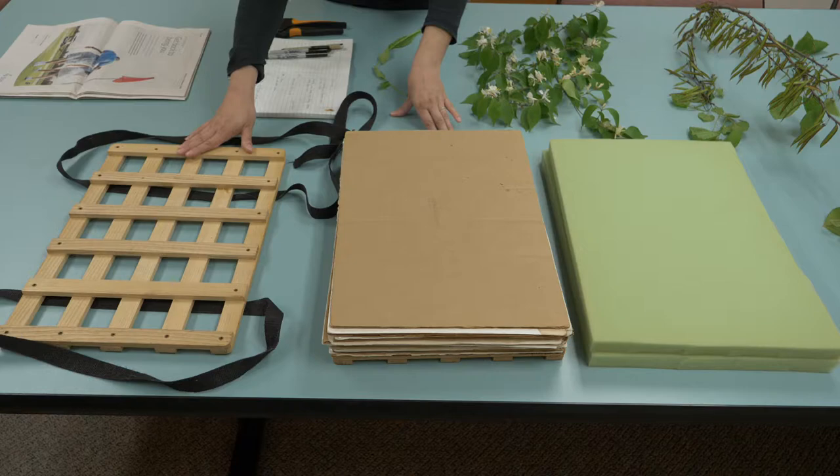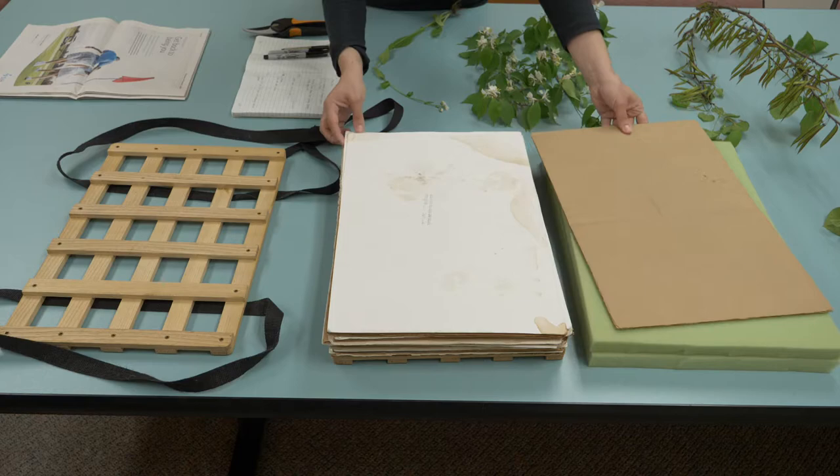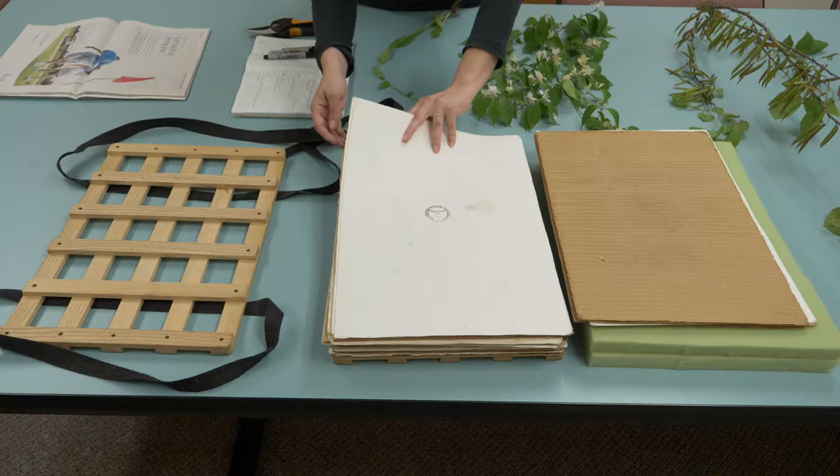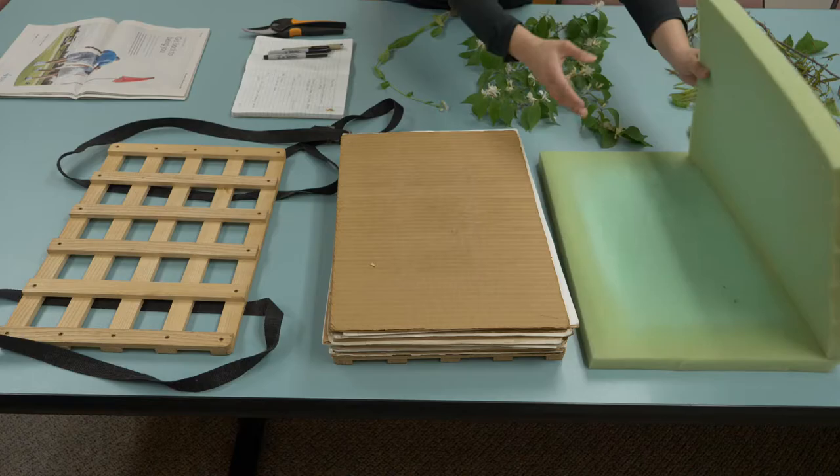A press is composed of two woody frames with straps, corrugates and blotters in this order: one corrugate, one and two pieces of blotter, then another corrugate, and again two pieces of blotter and another corrugate. And then at the end we have these foams.